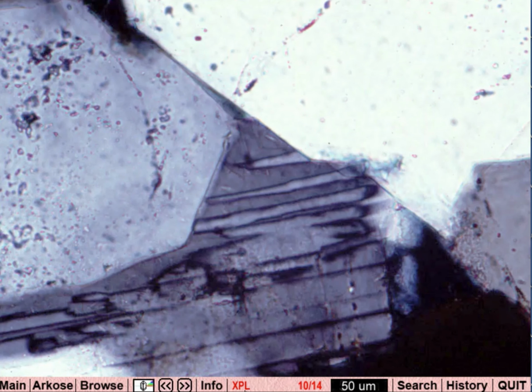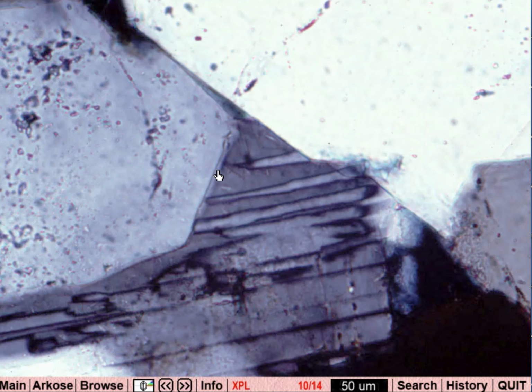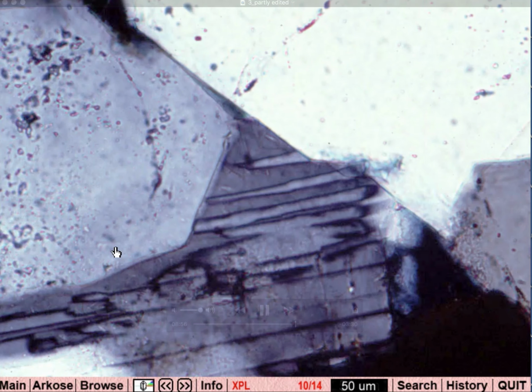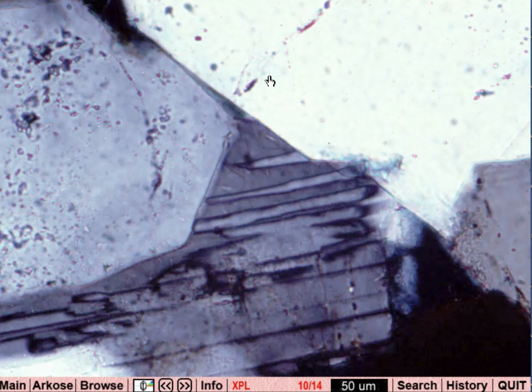All right, here we're really zoomed in on this one, and we've got some quartz, and the quartz has an overgrowth. So the older quartz has more inclusions or more defects in the interior, but the overgrowth has fewer defects and fewer inclusions. So hopefully you can see, and also the overgrowth makes a nice crystal form, unlike that rounded bit.